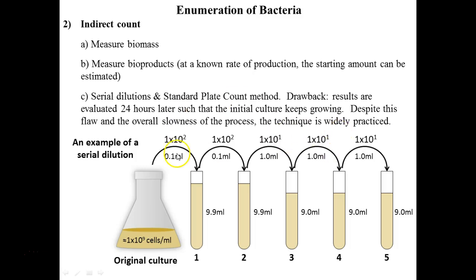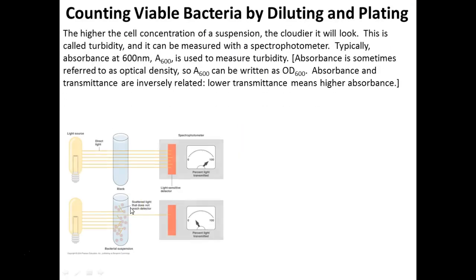Because they're doing this. They're trying to find out how much of the bad bacteria are in that water sample or those water samples they took. So we dilute in series because that's much easier, and we mathematically calculate the dilution factor for each tube in our dilution series.